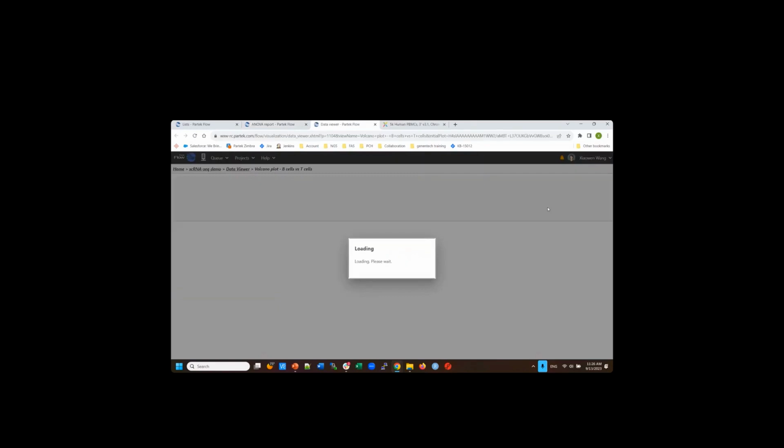So of course, the top genes are B cell marker genes, and you can sort it the other way. And this is definitely the T cell marker genes, right? And then for every comparison, this is how you invoke the volcano plot. So that's the more direct way.